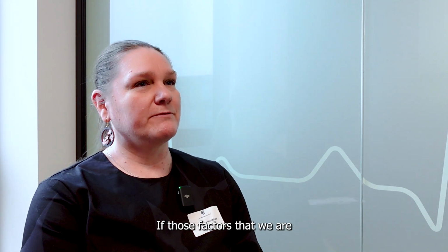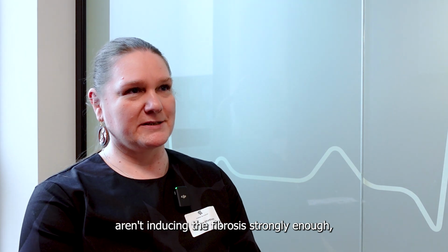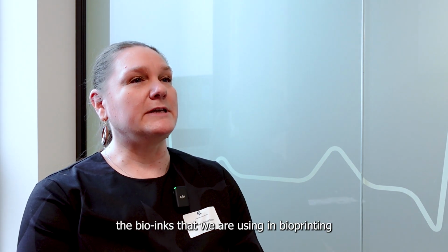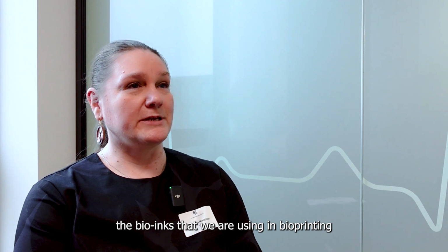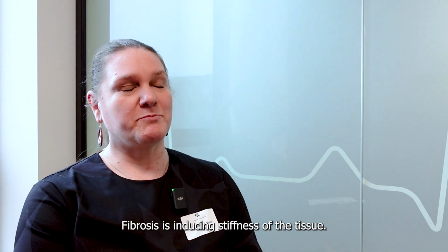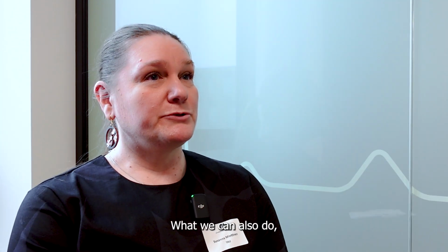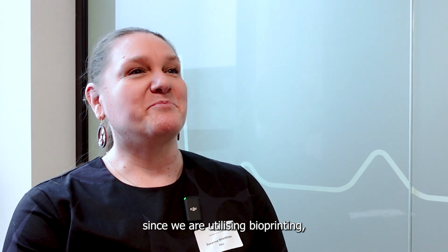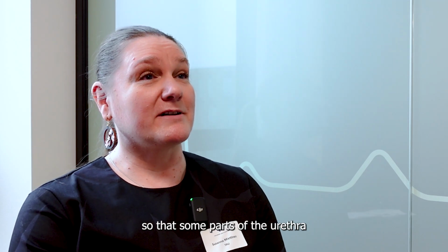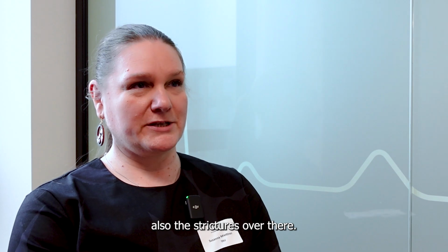If those factors that we are including in the model aren't inducing the fibrosis strongly enough, we can of course also modulate the bioinks that we are using in bioprinting so that they are stiffer to mimic the fibrosis. So fibrosis is inducing stiffness of the tissue. What we can also do, since we are utilizing bioprinting, is print the model so that some parts of the urethra are more strict and narrow, so that we are modeling also the strictures over there.